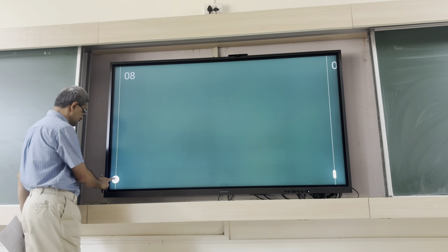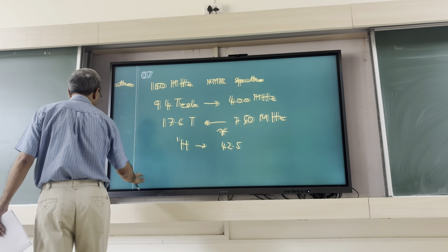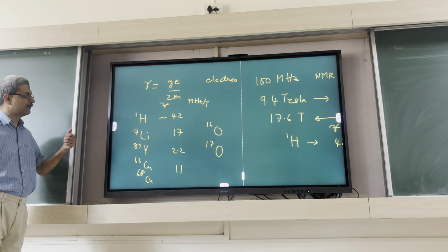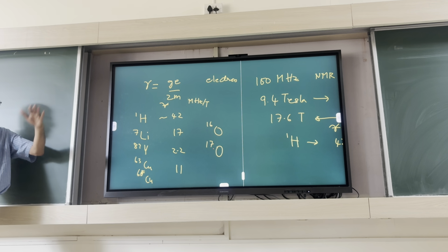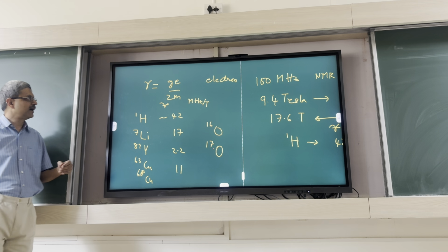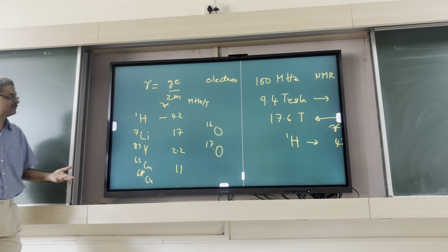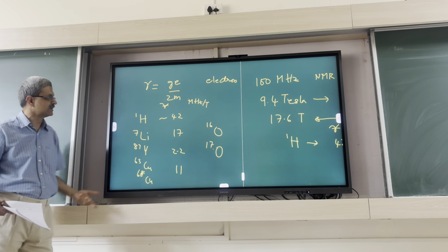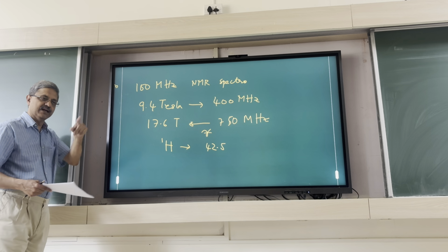Okay, so now, what point did we come to? We'll have these equally spaced energy levels, and you can apply a field which is perpendicular to the DC field, and then enable transition between various levels. And it is basically determined by what the gyromagnetic ratio is for that nucleus, because for a given field, the gyromagnetic ratio will determine what frequency you observe the resonance. Okay? And of course, as we said, the transition is possible only between neighboring levels.